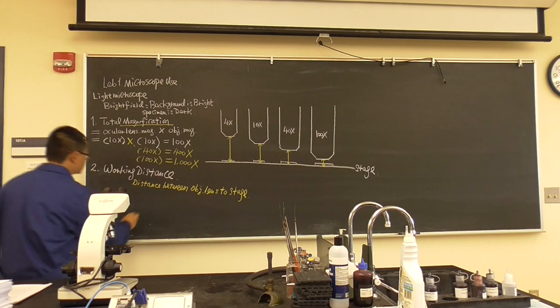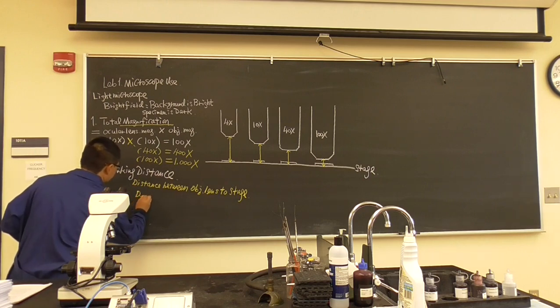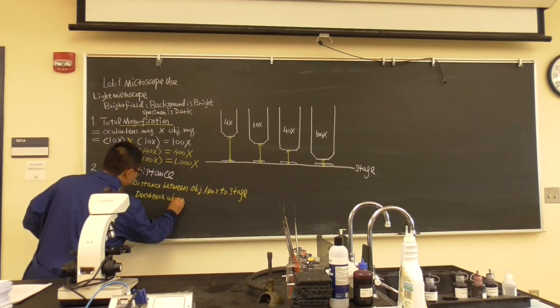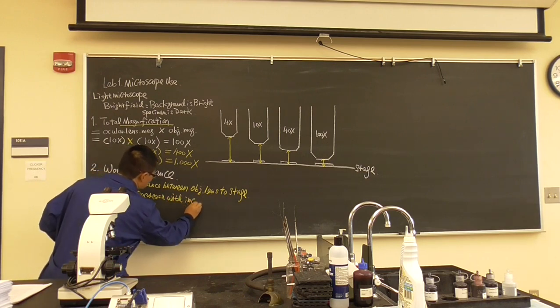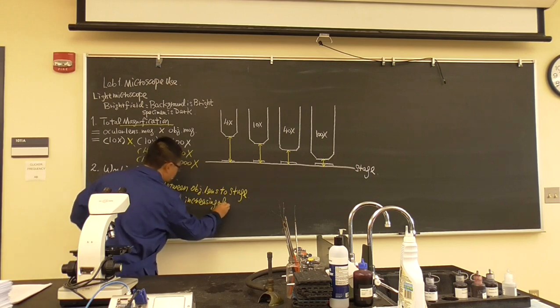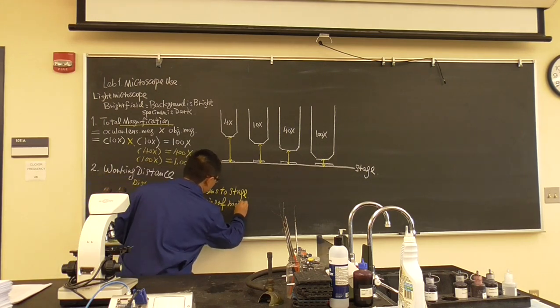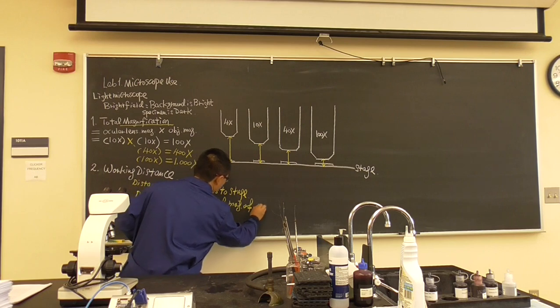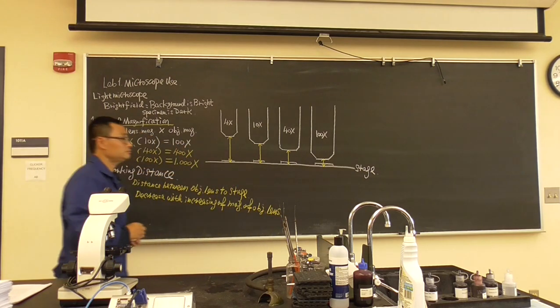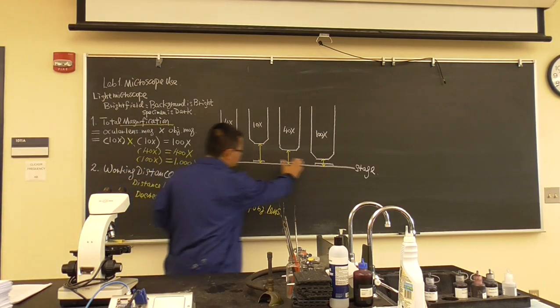And the distance is decreased with increasing of magnification of objective lens. And you can see it.